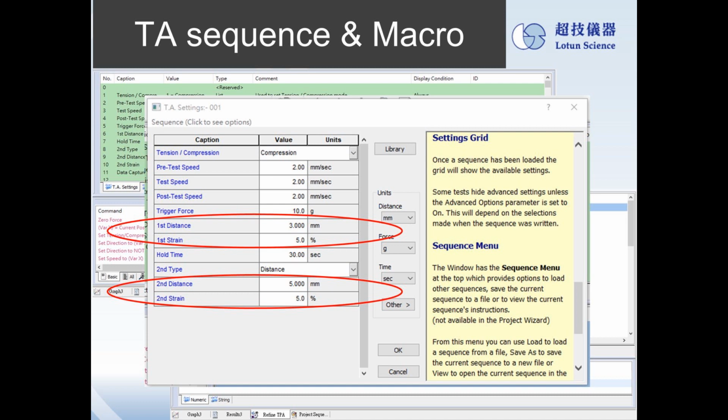The aforementioned modulus with pre-programmed TA sequence and macro are editable. All the modulus have a function of auto-reminder to ensure the accuracy and precision of the calibrations. The modulus also provides visualized interfaces to customize different analytical stages.